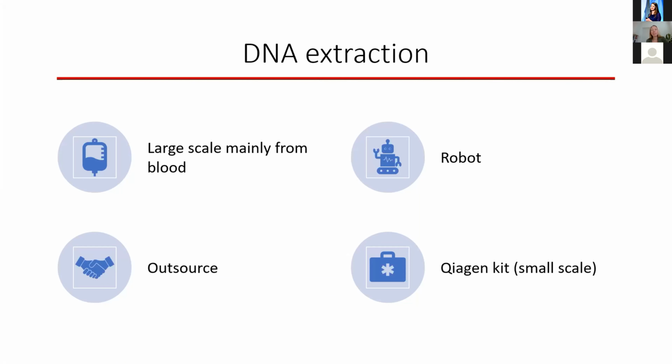DNA extraction is a very common thing to do with your biobank samples. If you have a large-scale cohort, the DNA is mainly from blood. And with large cohorts, a robot extraction method is recommended.